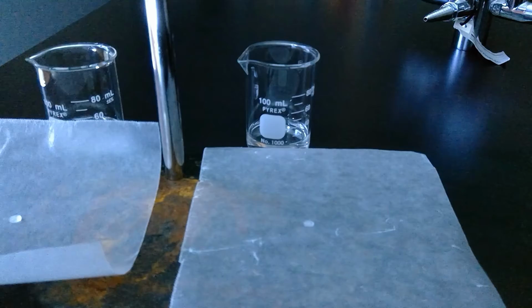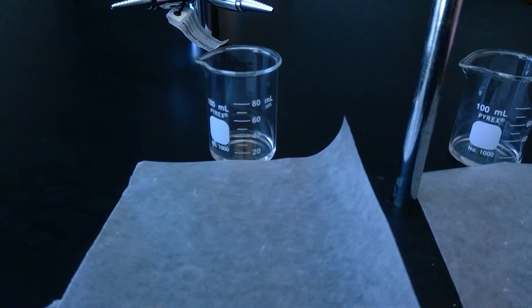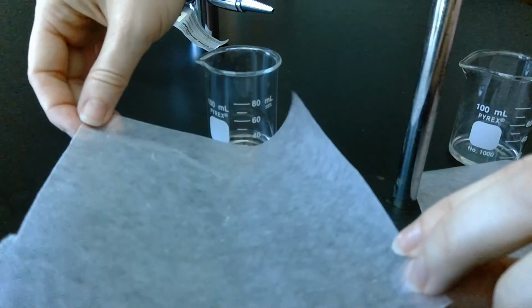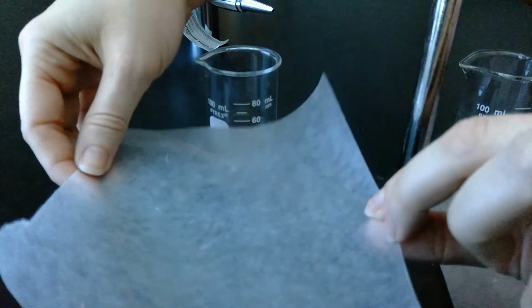Now we'll do the same thing with isopropyl alcohol. This one makes it really hard to see, but this flattens out and does not stay as a rounded drop, which is why it's so difficult to see.